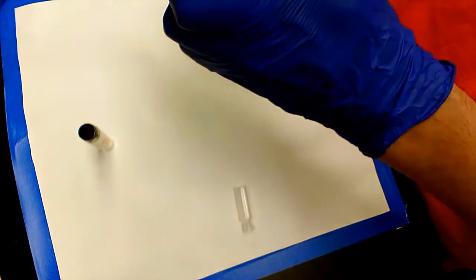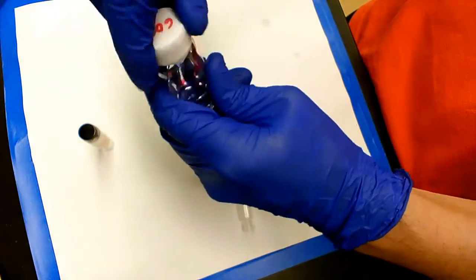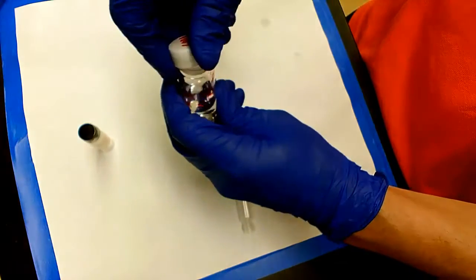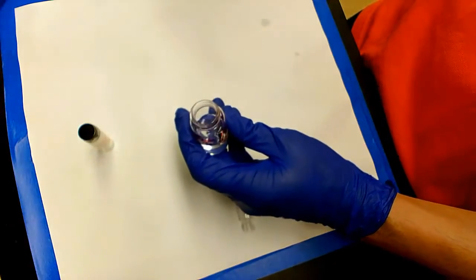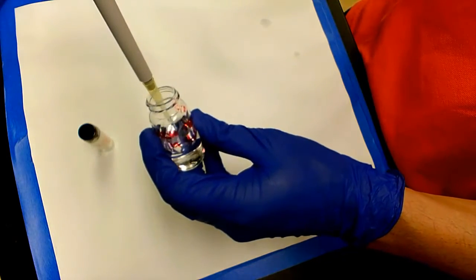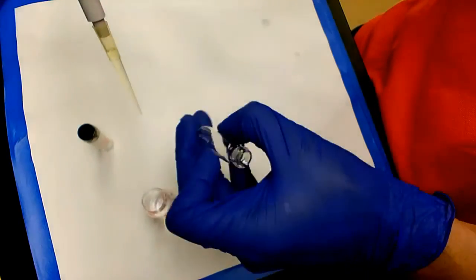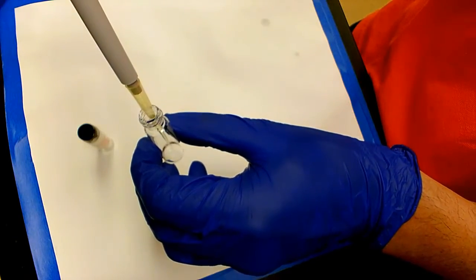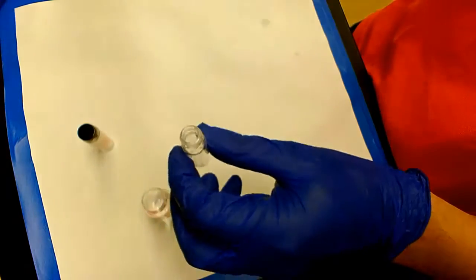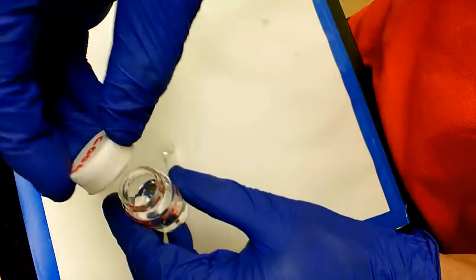Alright, so let's remove the cap, and then I'm gonna show you. Alright, so I get 200, and I'm gonna put it into this clean vial we have. Perfect. And I'm gonna set it to the side and close the lid of the polymer stock, right?